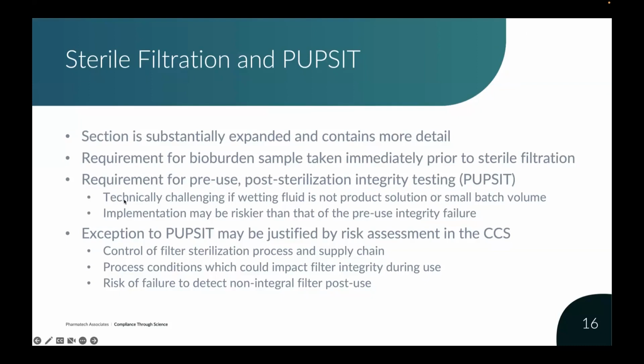Now, this is understood to be technically challenging, particularly if the wetting fluid is not the product solution, right? If it's not the product solution, then of course, after your integrity test, there's some flushing or removal of that wetting fluid that needs to be done before you can collect the sterile filtered product. Or if the batch volume is particularly small.